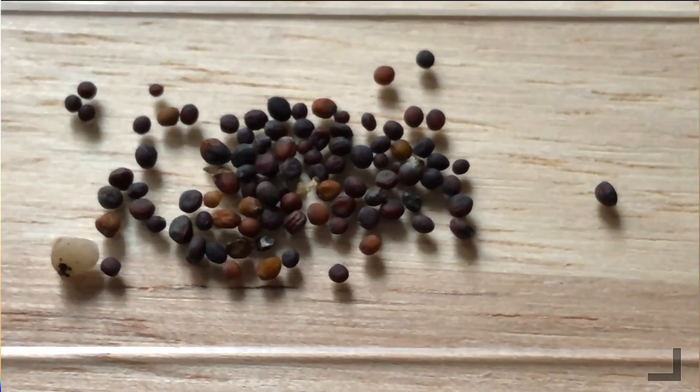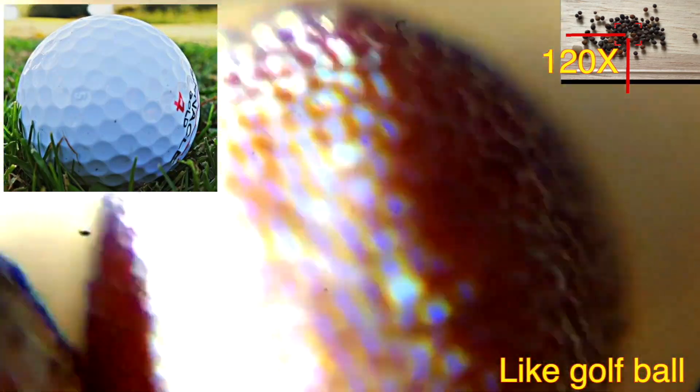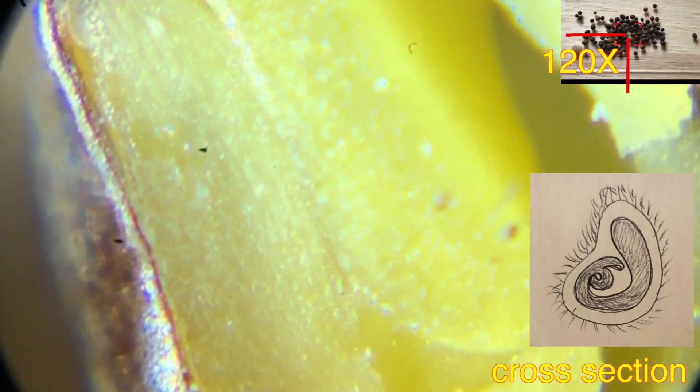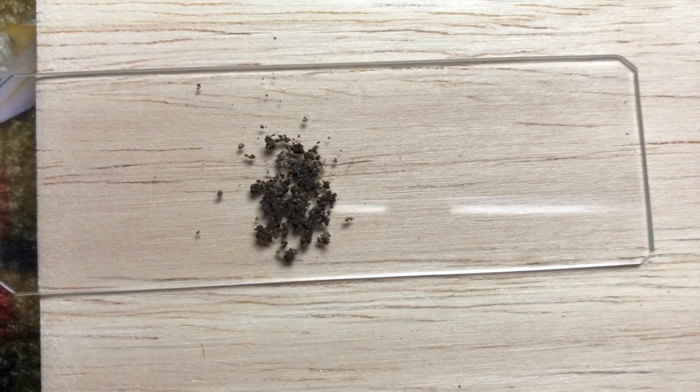Let's look at mustard seeds under the microscope. You can see these seeds are pretty like a golf ball — it's interesting. Let's check the cross-section: you can see the seeds wrapped inside it.